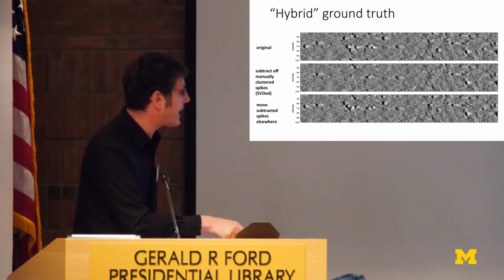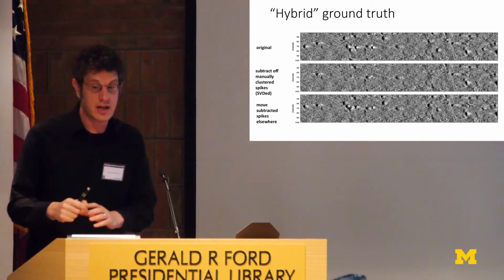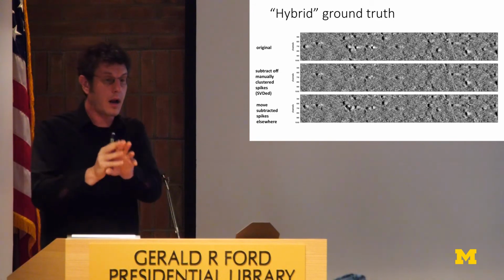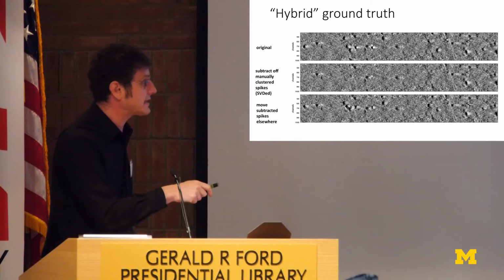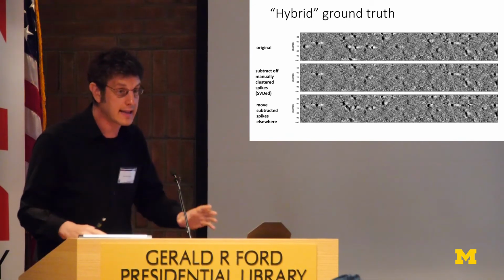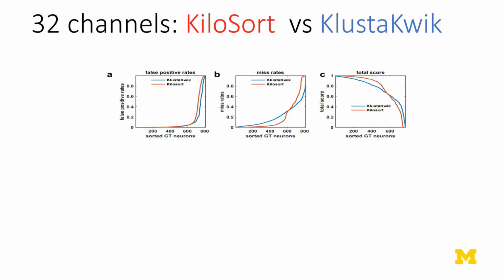And after that, we repaste it back in to a slightly different place. What this has done is it's kept the amount of synchrony that you had originally in the data. So remember that the time that's worst for this spike sorting is when lots of neurons fire at the same time, close together in space. After we do this trick, this is preserved, because we've taken out the spikes and we've shifted them all down by 10 channels or so. So we know when they fired, where they fired, and the level of synchrony is exactly the same as it was in the original data. The relationships between the cells and the relationships between the cells and the local field potential is exactly the same.